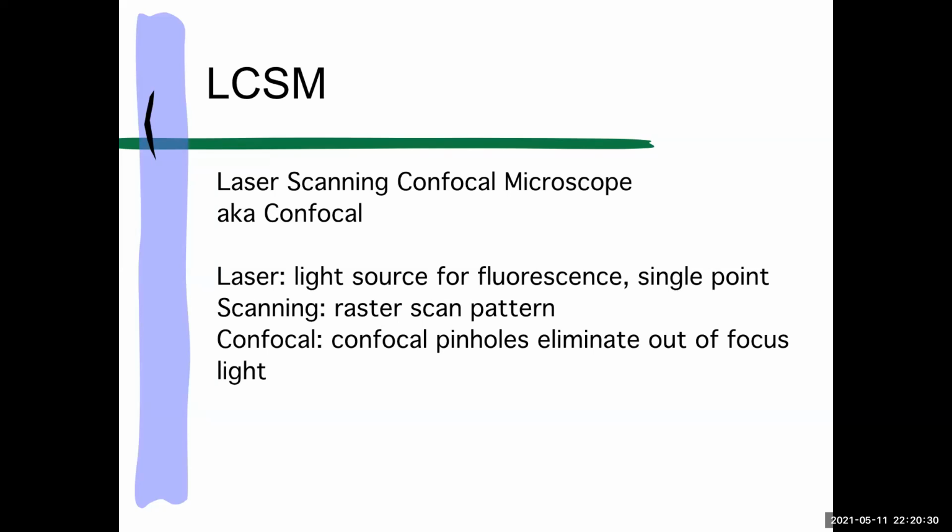So as you can guess, the confocal takes longer, and there's all sorts of great things that come out of the fact that you're illuminating only that one spot. Of course, notably the fact that you're eliminating out of focus light, but there's also issues with bleaching and so on and things like that. And you know, how bright is the signal? Bright enough? Is it dimmer in general?